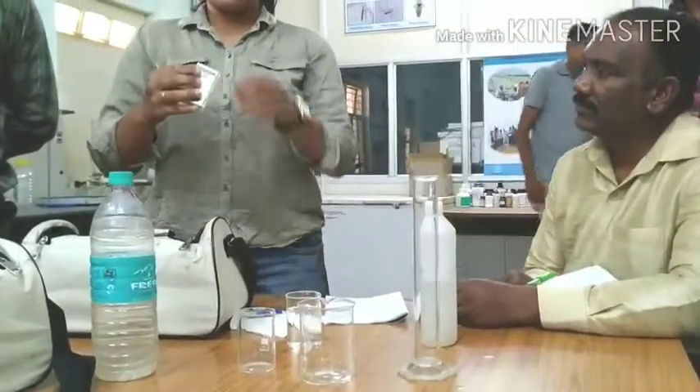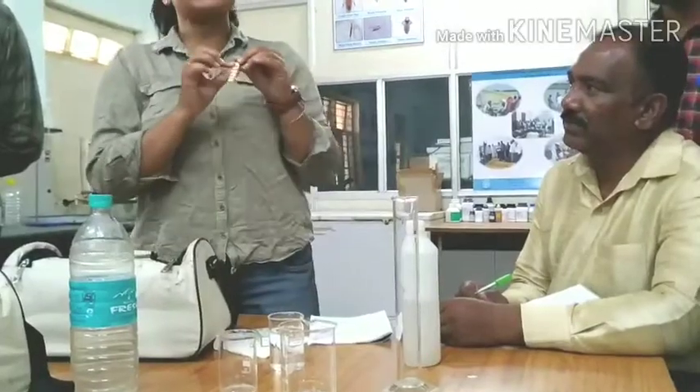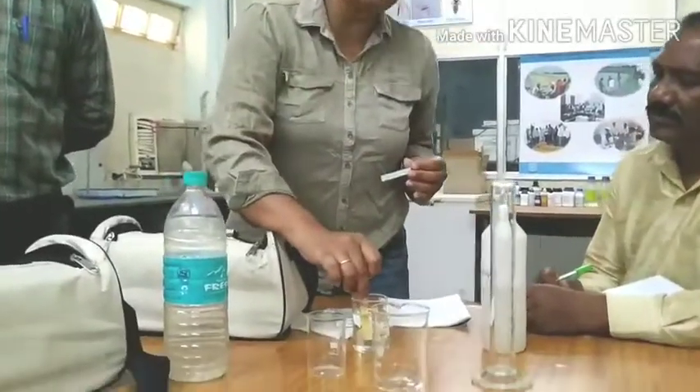If you get a chemical instrument, you'll get a pH paper. It's a range of colors. This is the pH paper. You can dip the pH paper in the water.